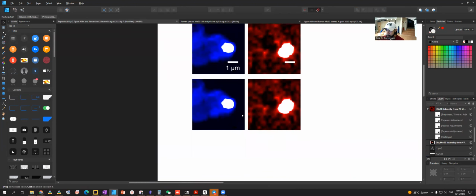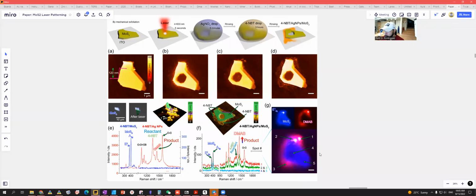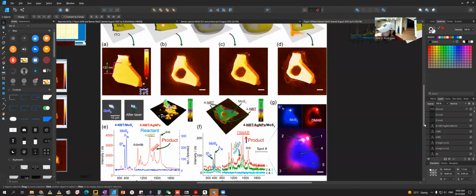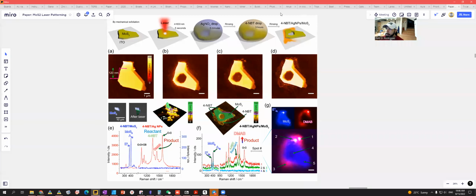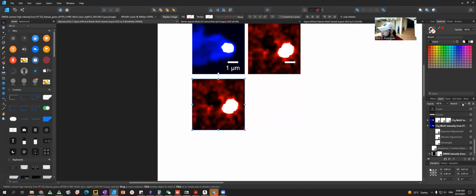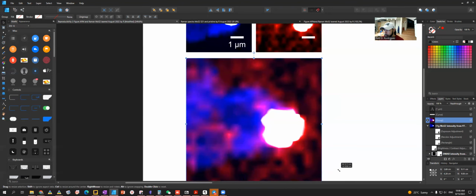As you saw, I just duplicate. I want to put this one here. It doesn't actually matter how I do it. I need to remember which filter, how did I do that? One of the ways was to take this figure and add it to the other one. Yes, the red one on top, added to the blue one. Simple. So let's take that one, add it to the other one, and select. And that's what we got. And that's it.